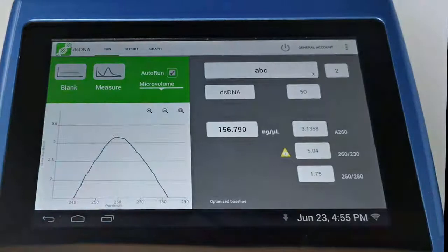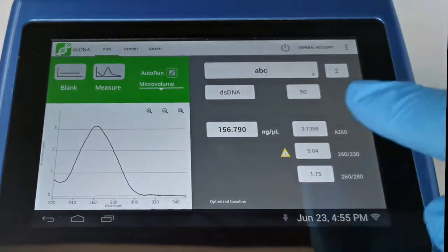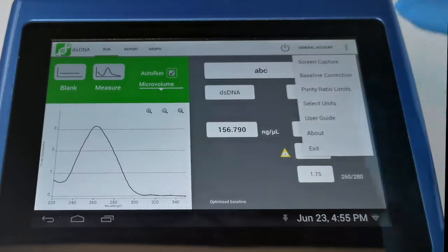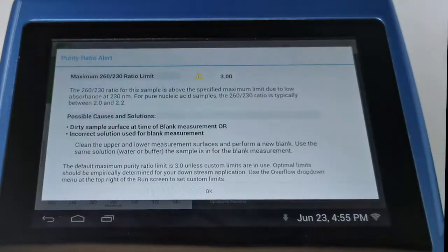So what you'll see is with this sample, it still looks pretty good according to the trace, but on the right hand side under our 260-230 ratio, you'll see a yellow triangle has appeared, and these are our contamination alerts. So the contamination alerts check our purity ratios and check to see if they fit within accepted thresholds, and we can set those as custom values if we want to, but the commonly accepted ones are hardwired in. And if we touch the yellow triangle, you'll see that we get a load of information related to what might be the issue with the sample.